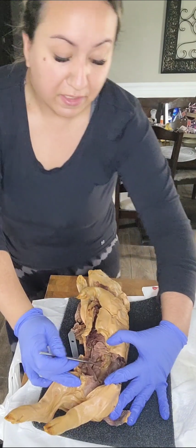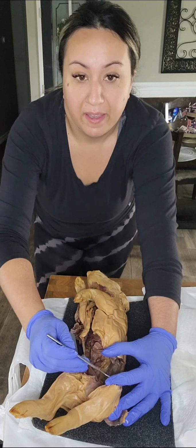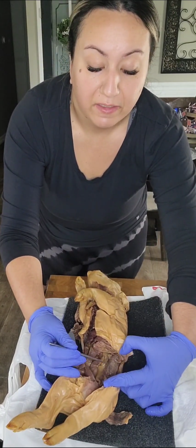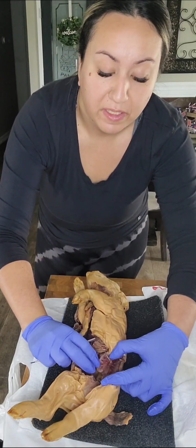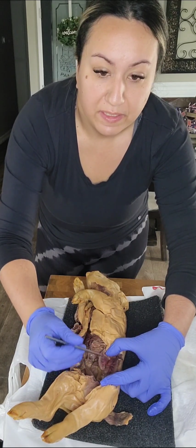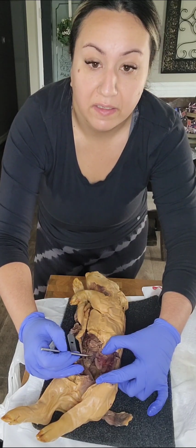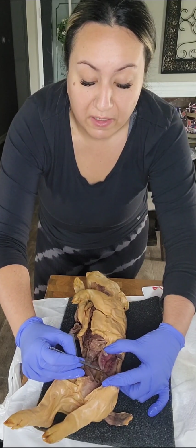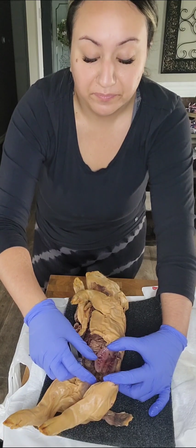Okay, so we have our ureter, which is here right underneath the bladder. It kind of connects the whole area together. And we have a fat located around our kidneys here. It's like a layer of fat. And then I did open up our kidneys here where you can see inside. You can see our renal medulla, which is right in this area right here. And you could also see our cortex right here. It's very prominent. So if you can get a glimpse of that.